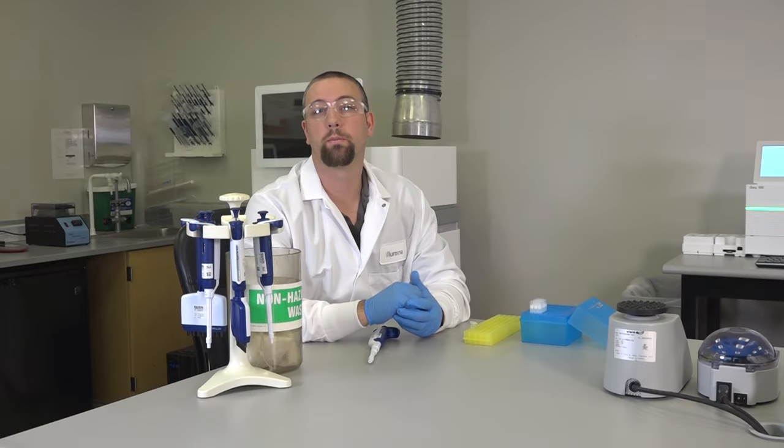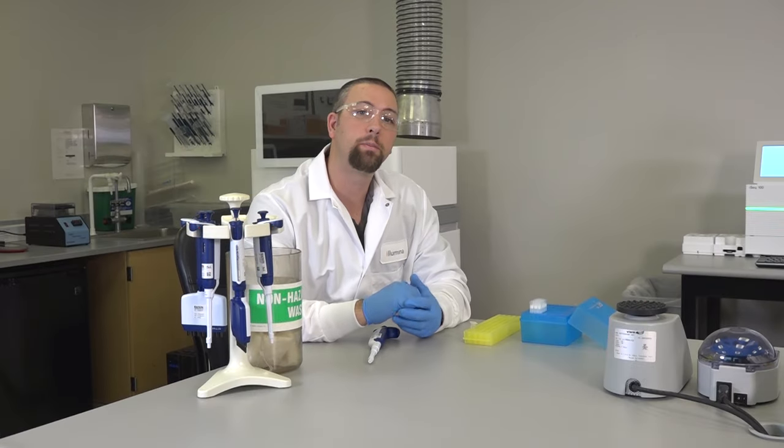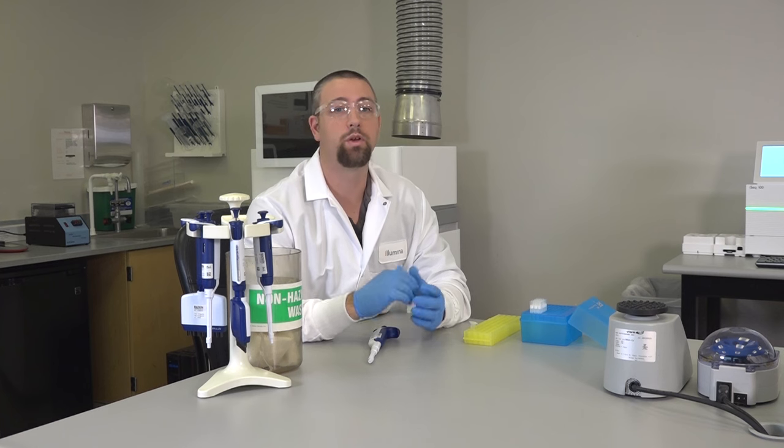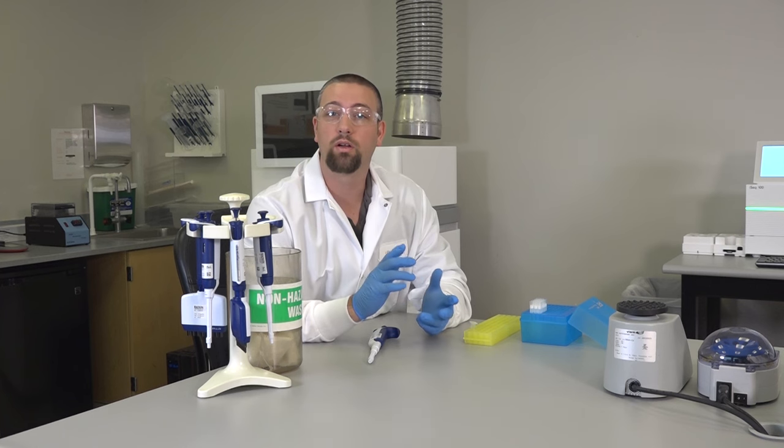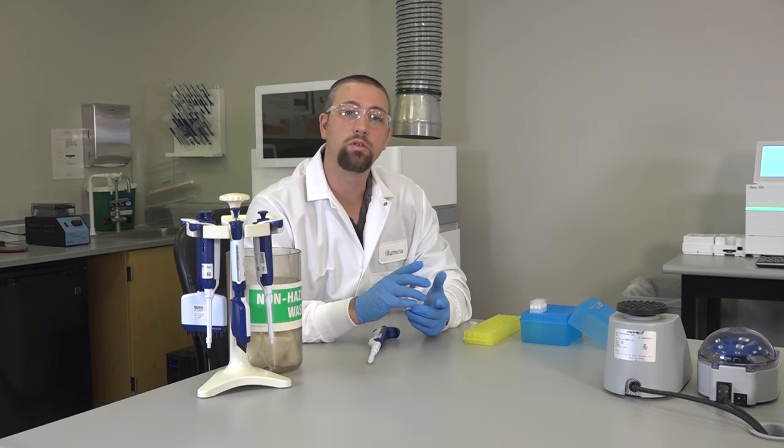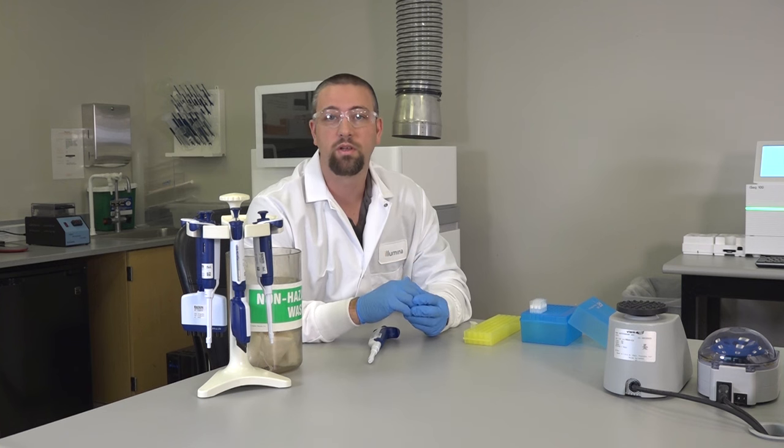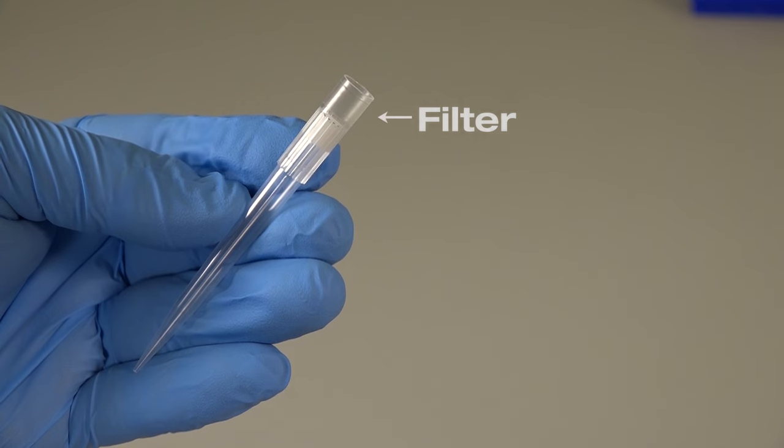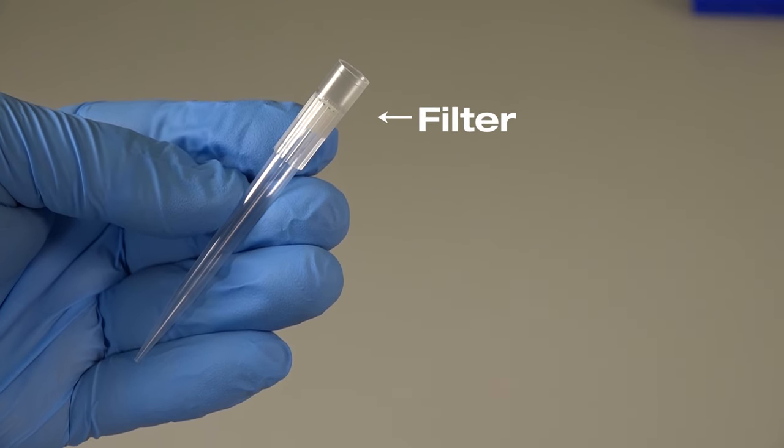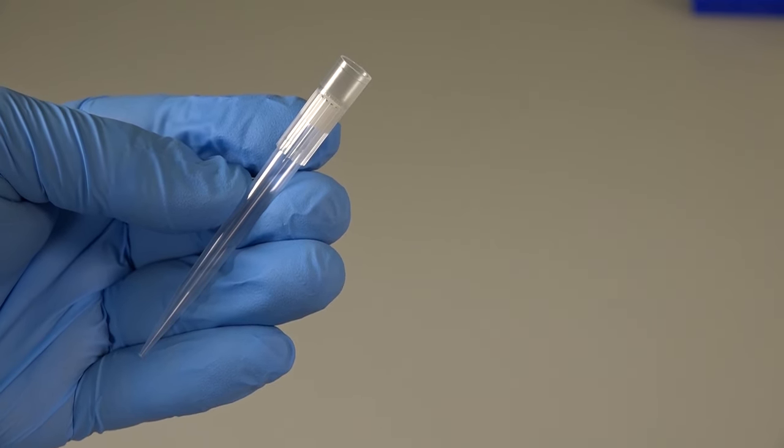Even if you're using perfect pipetting technique, sample-to-sample contamination can still occur due to aerosols. An efficient way to combat aerosol contamination is to use aerosol and liquid-resistant pipet tips, or barrier tips. These types of tips commonly use a self-sealing filter tip to prevent liquids or aerosols from contacting the pipetter.